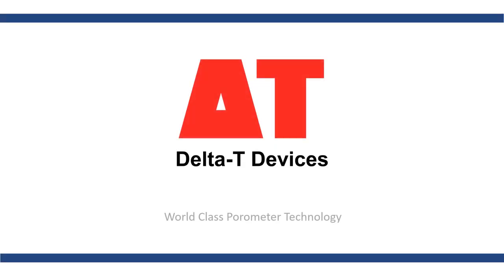Delta-T Devices, providers of world-class porometer technology.